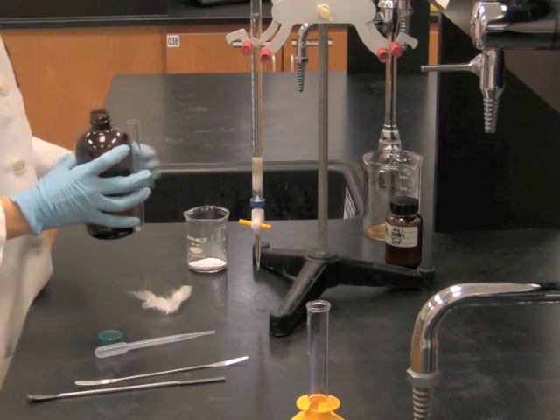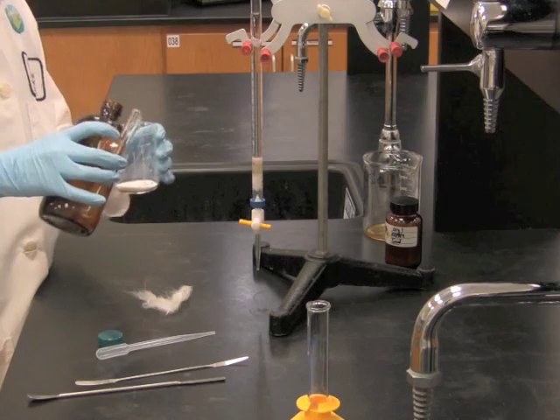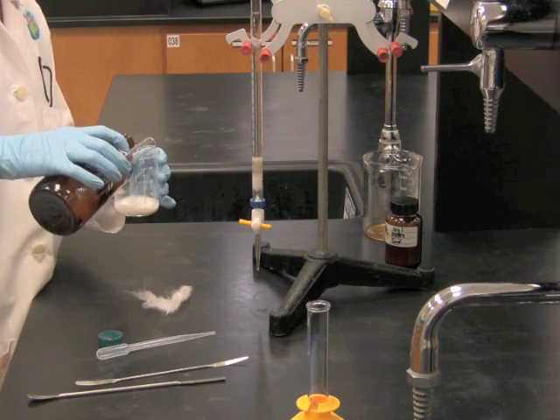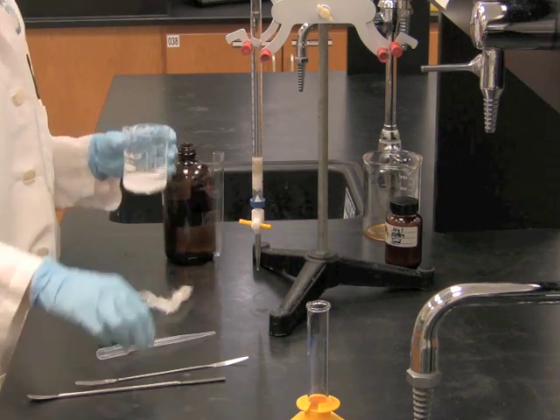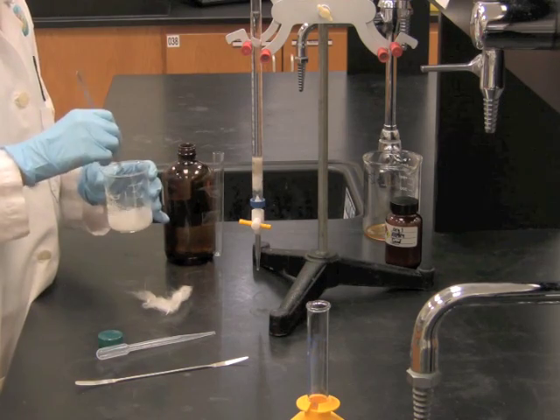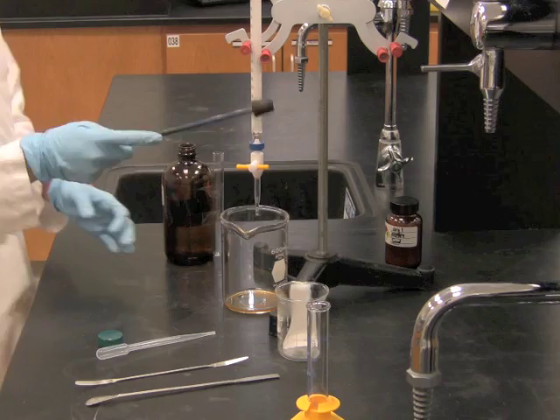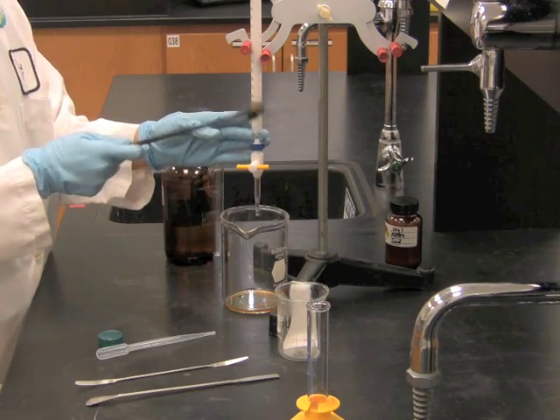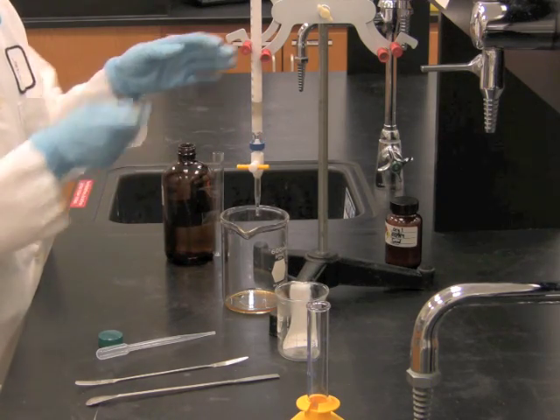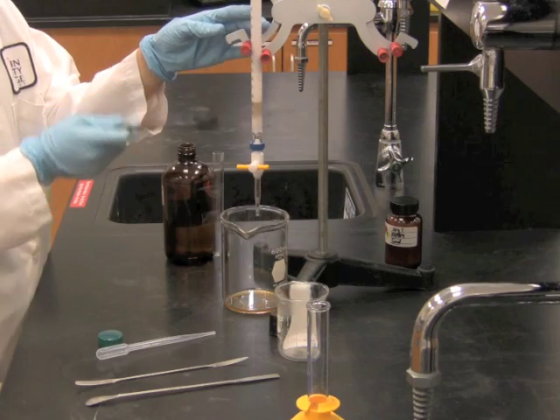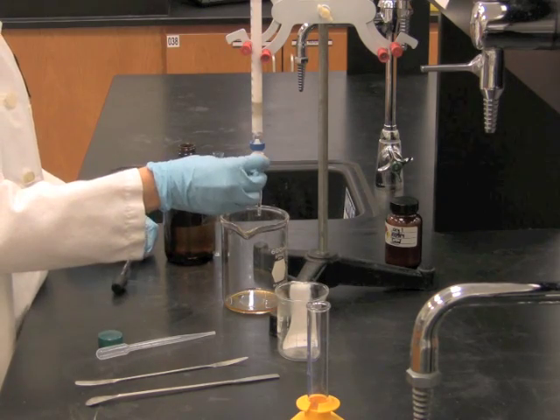And then I'm going to add the petroleum ether to the alumina to get it suspended as a slurry. You can also tap the column with a rubber stopper to make sure that the alumina is distributing evenly.